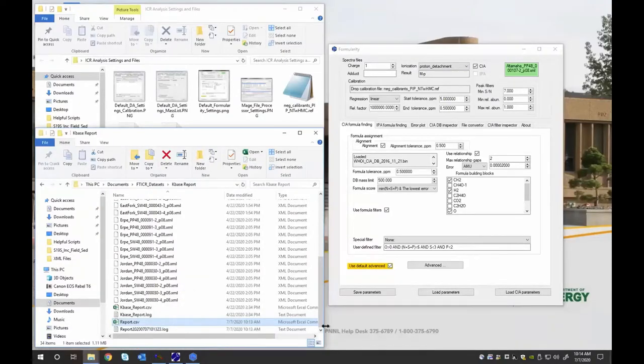Anytime you download Wonders data, we do have scripts that take into account whether or not samples calibrate well or not. And so you should run those. We do provide those scripts and things like that, so they're readily available to you. But you should download those scripts. And if you are analyzing Wonders data, remove badly calibrating samples to ensure that things don't go wrong.